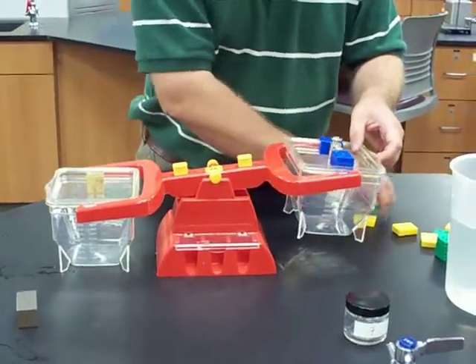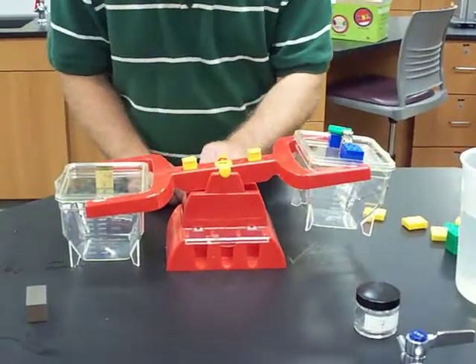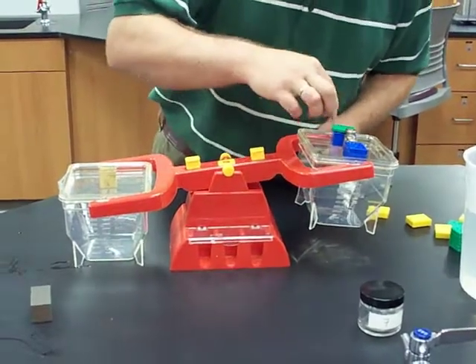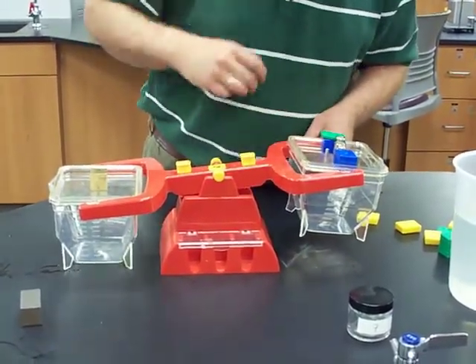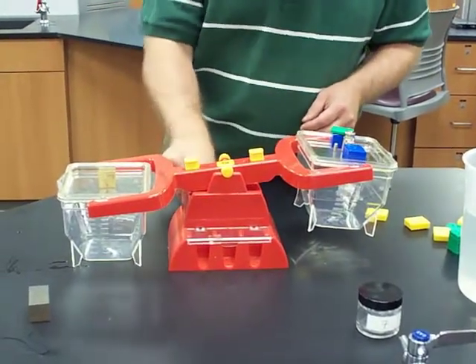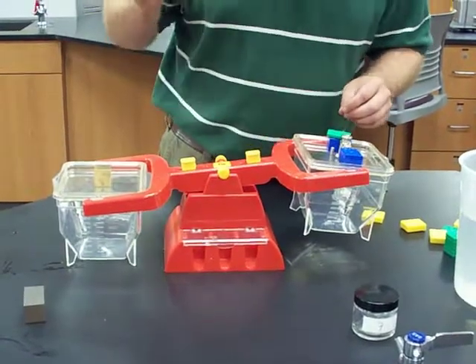So 130, 135. Again 90, 110, 130, 135, yeah. 137. 138.